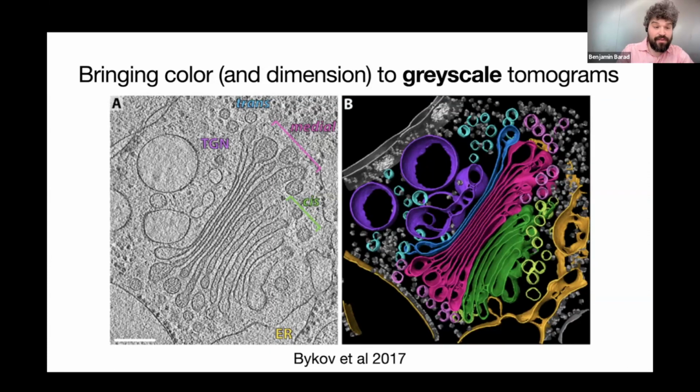So you may have already seen this tomogram. I would say that this is probably the most famous cellular cryo-electron tomogram, at least. This was a beautiful Golgi segmentation by Ben Engel at the time. From this grayscale image on the left, where you see all of this stuff, and we as humans are quite good at finding it, you're seeing a single slice. With a segmentation, suddenly you get to build a three-dimensional color map of what you're looking at inside of the cell. We definitely joke that this is the segmentation that sold 100 Aquilos instruments. This paper was very motivating for people to start milling.